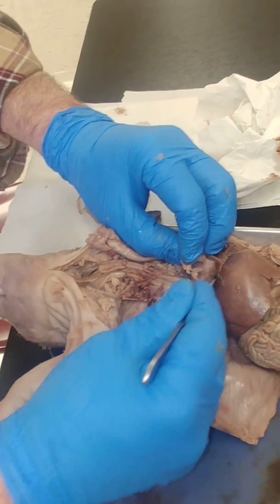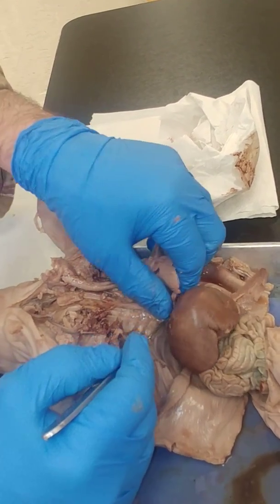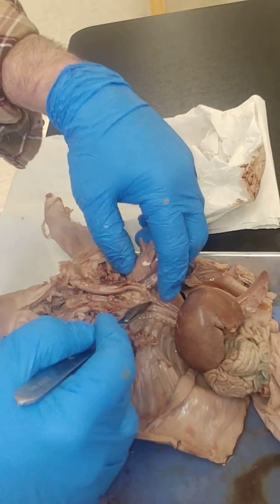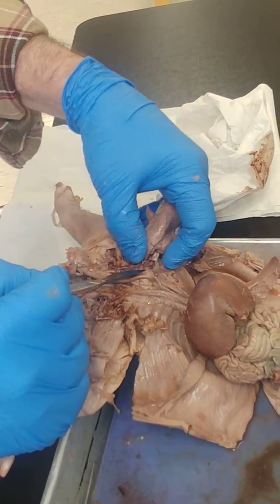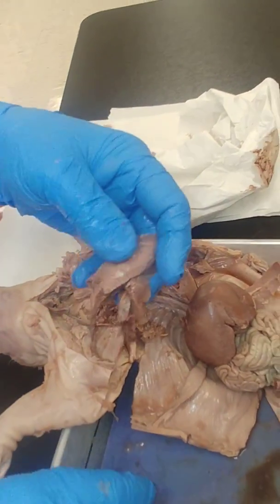Okay, now it looks like this is connected to the liver, but it isn't. You've got some blood vessels going through there that are making it look like that. So, I mean, it is connected, but it isn't, if you want to look at it that way.